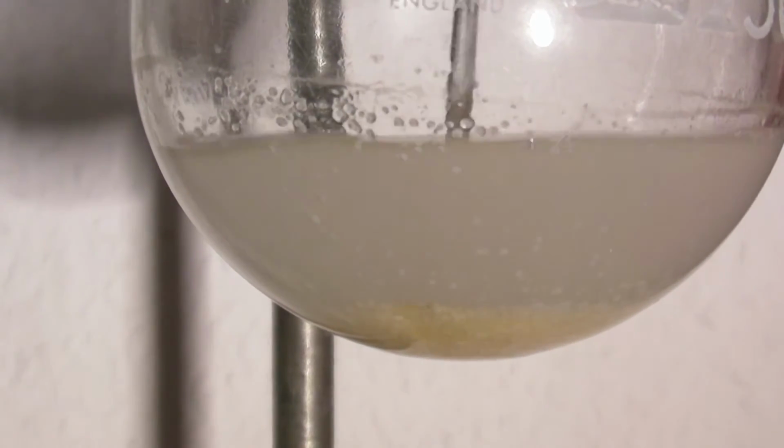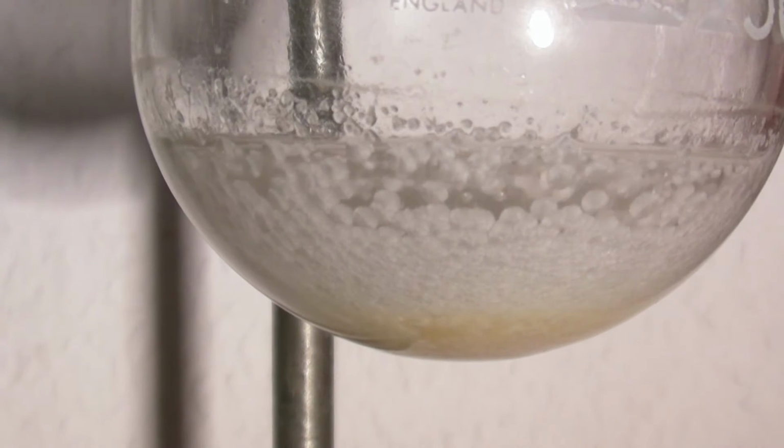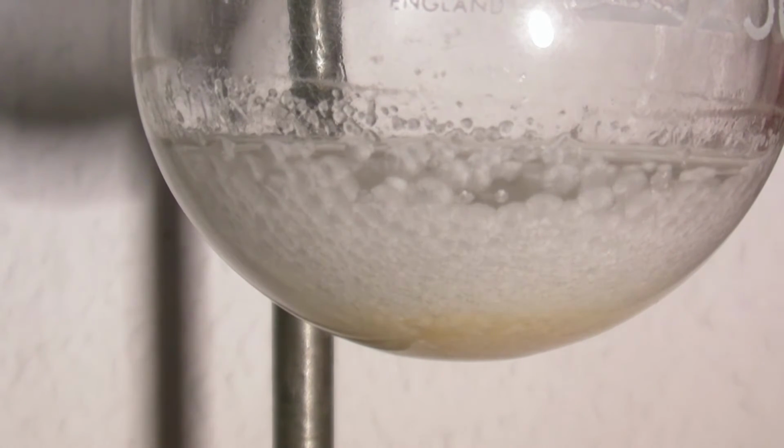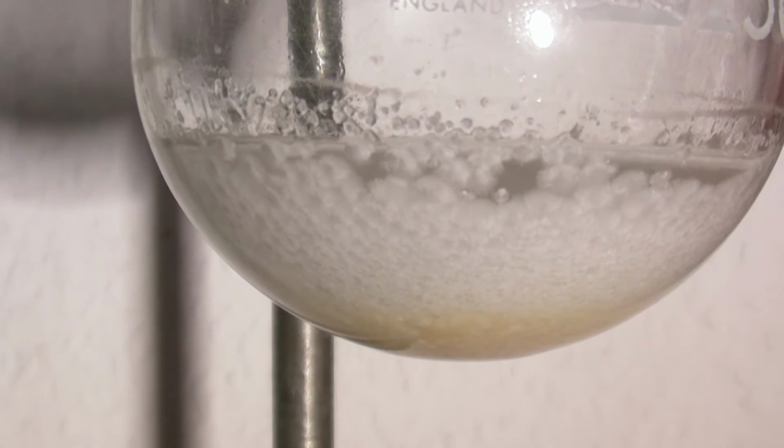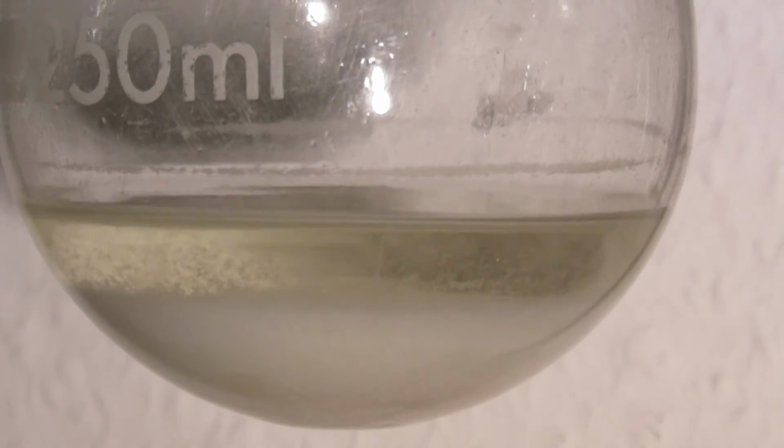Needle-shaped crystals began to form, which is also the crystal structure of benzhydrol. The slight yellow color indicates that the benzhydrol still contains impurities, but these are low enough for my purposes. Of course, more recrystallizations would lead to a way higher purity. After breaking up the mass, it becomes visible that the solvent contains most of the impurities.